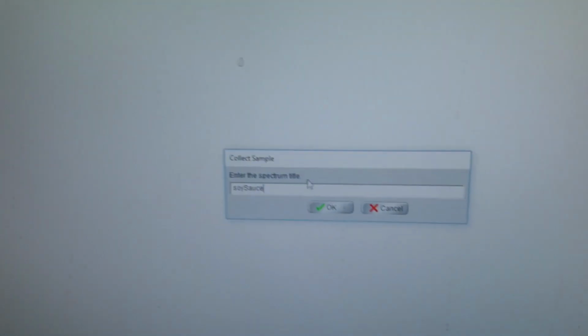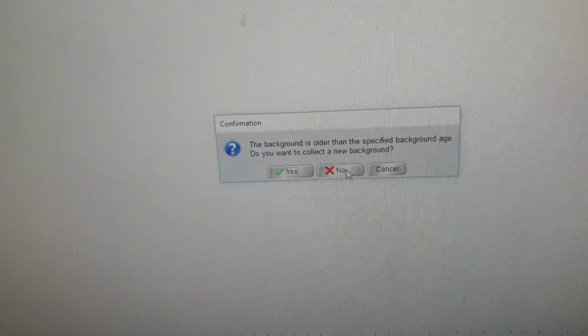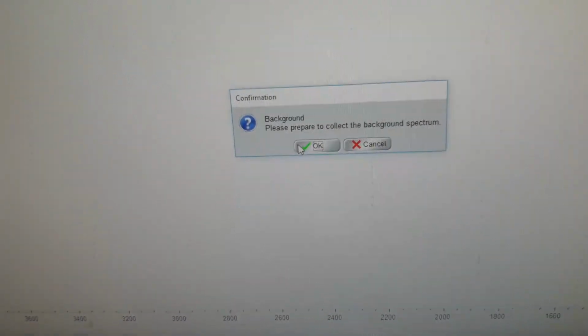Doing some IR spectroscopy on soy sauce. Let's see what we get. Yes, collect a new background. Right, let's see if we get something.